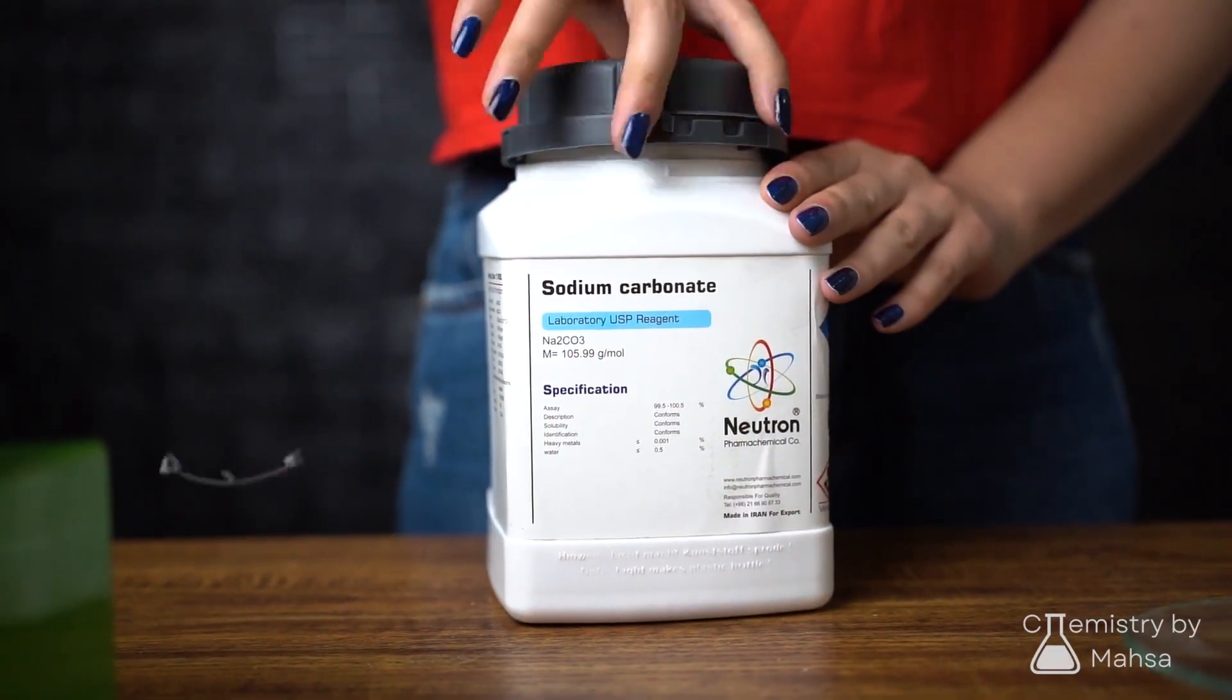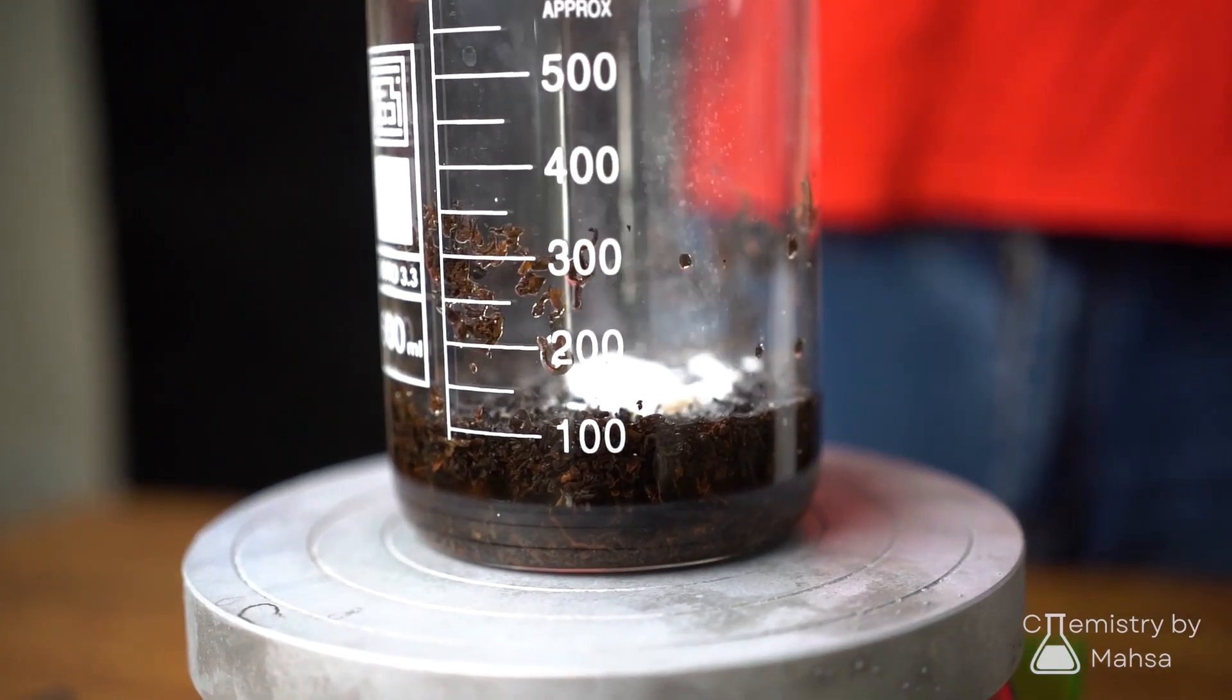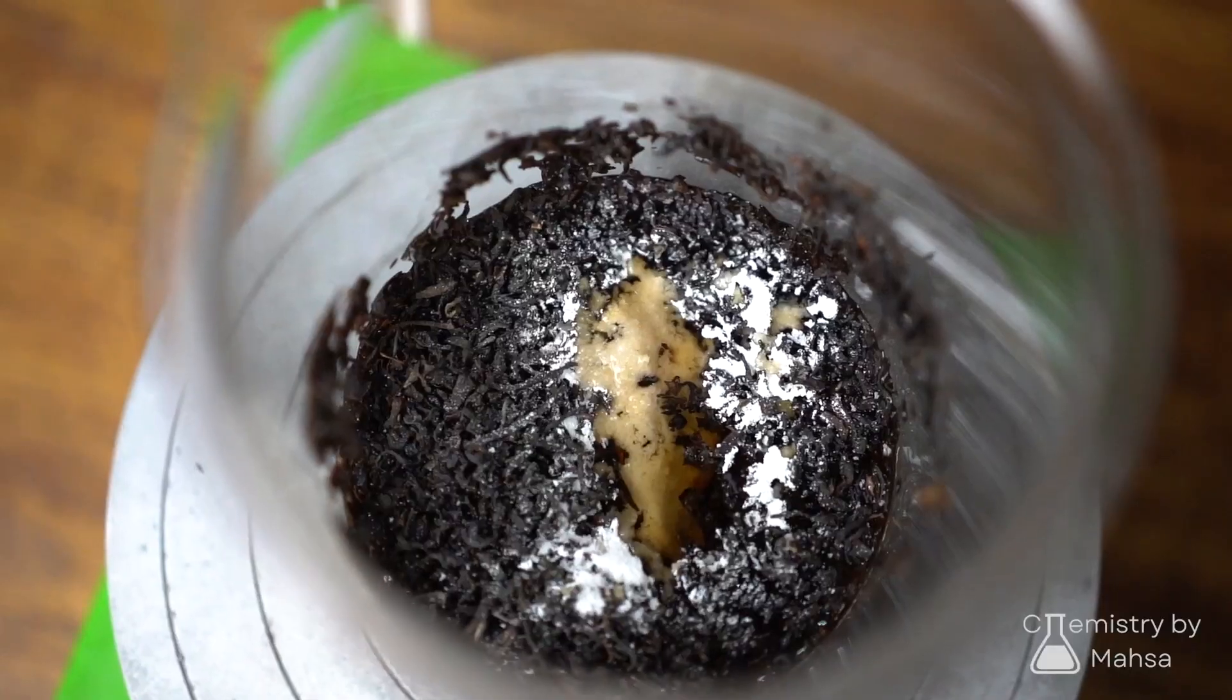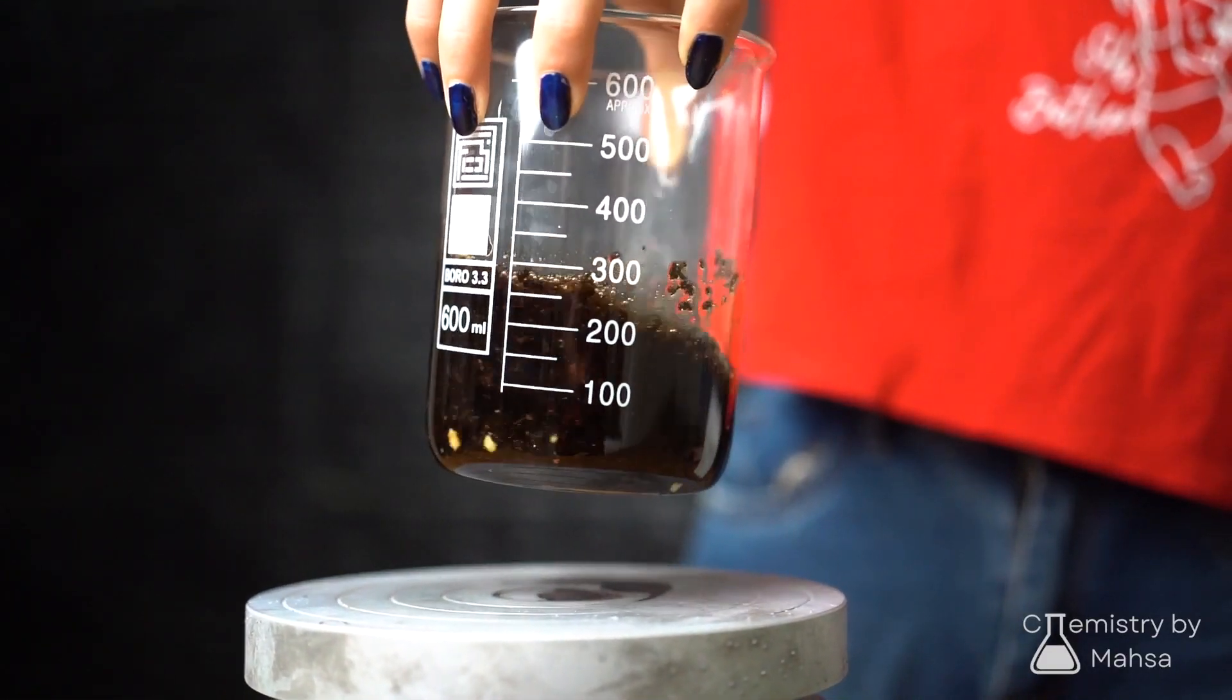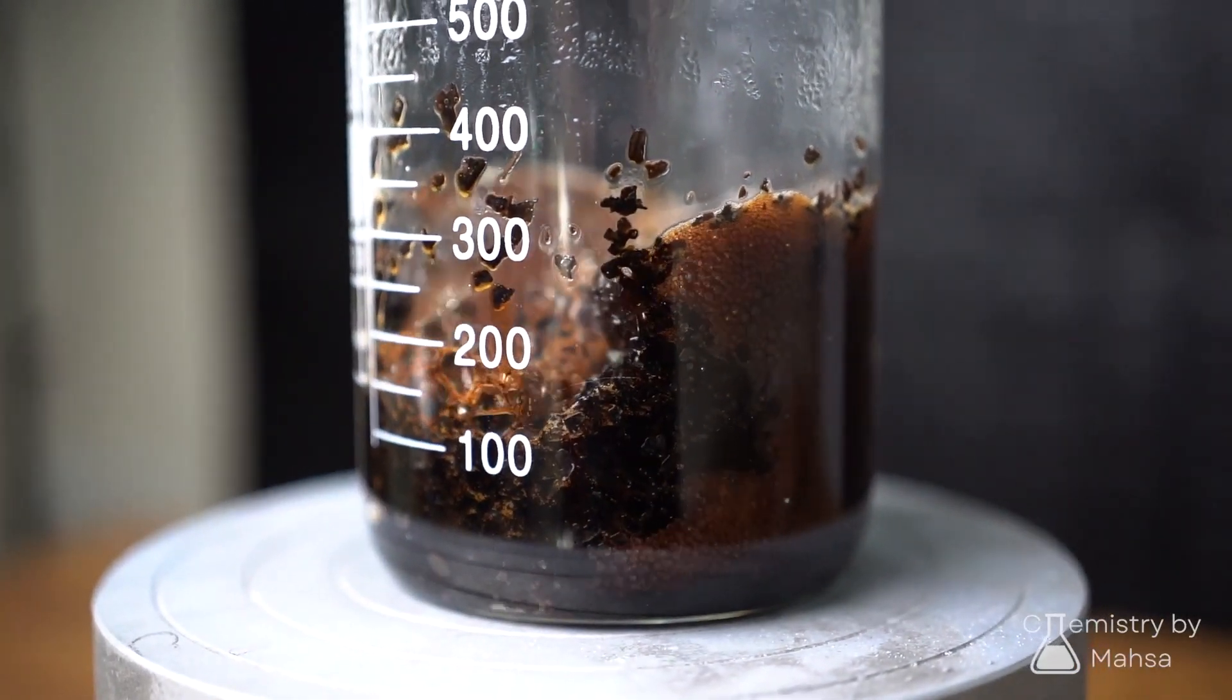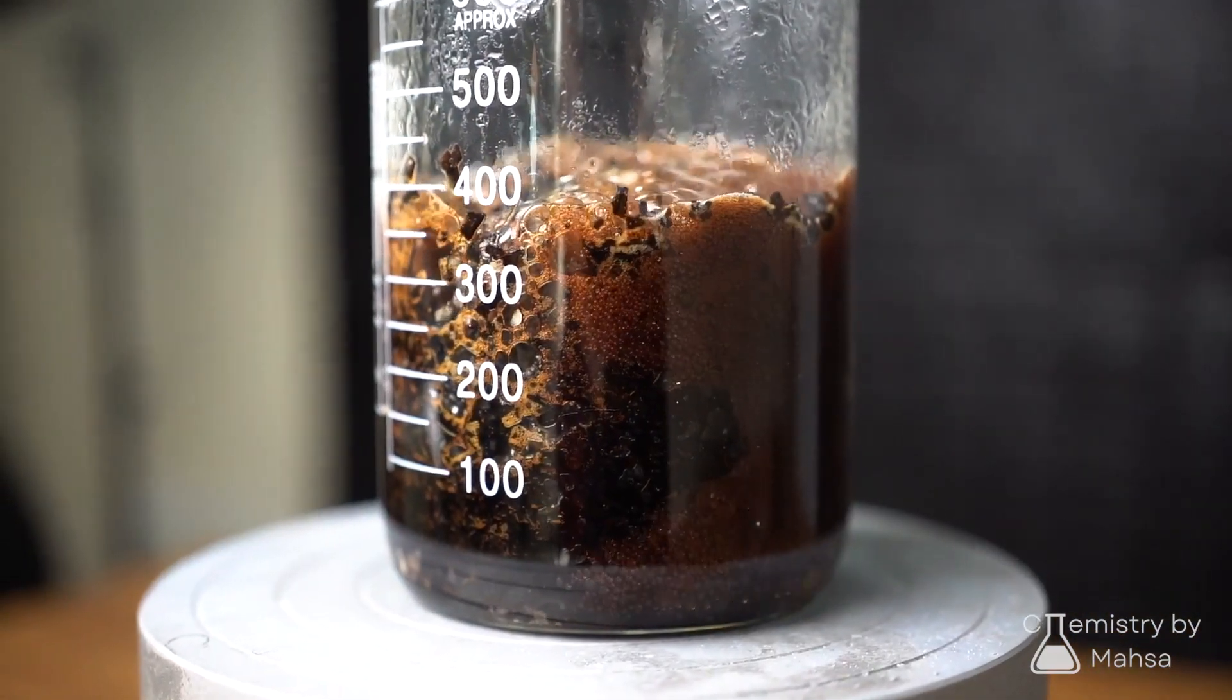Tannins are naturally occurring compounds found in tea leaves and can interfere by forming complexes with caffeine. To eliminate this, 6 grams of sodium carbonate was added. Sodium carbonate's basic nature reacts with tannins, causing them to form water-soluble complexes. Remember to cover your beaker to prevent water loss and boiling continued for about 10 minutes.